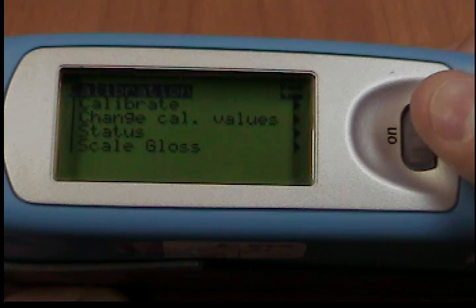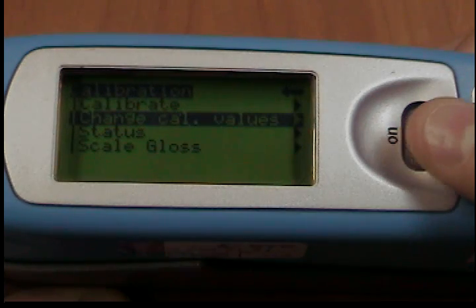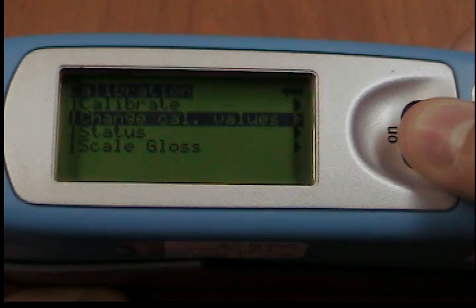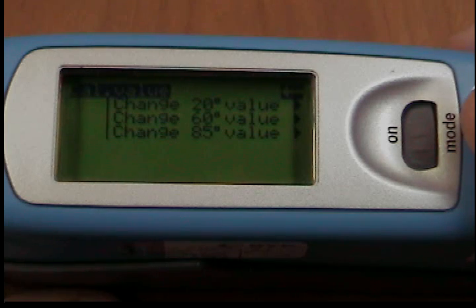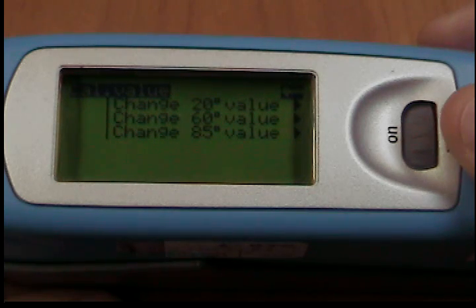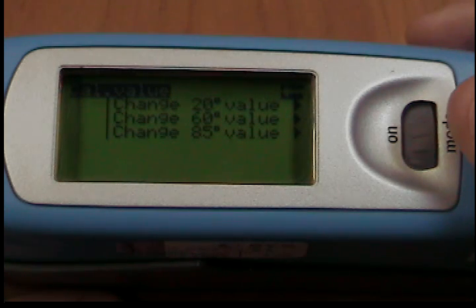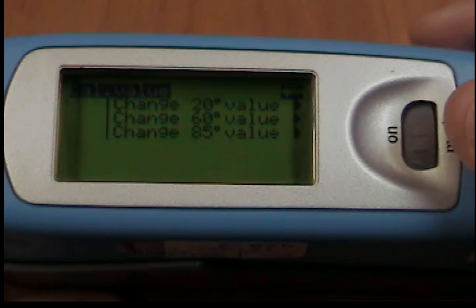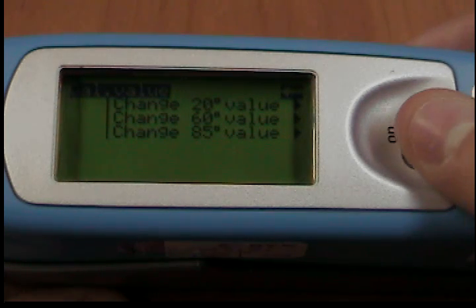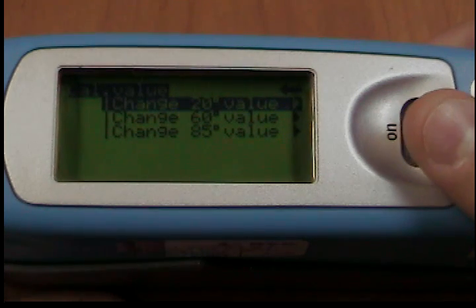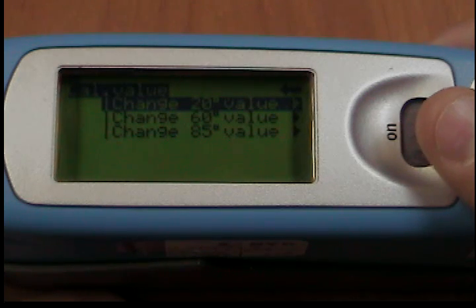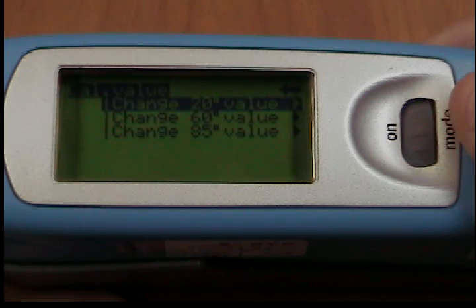Changing calibration values. The gloss values of the calibration standard in the holder included with delivery are saved in the measuring device. During automatic calibration, the data is assigned to the standard in the holder. In some cases, it will be necessary to enter data for a new calibration standard — for example, if there is a previous standard that has been damaged or scratched. To ensure exact calibration, only original standards from the manufacturer should be used.